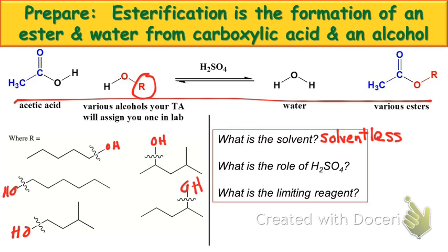Okay, what's the role of sulfuric acid now? It's going to be the acid catalyst. Okay, so it's there to change the mechanism to speed our reaction along.